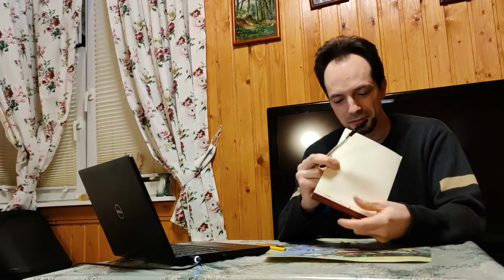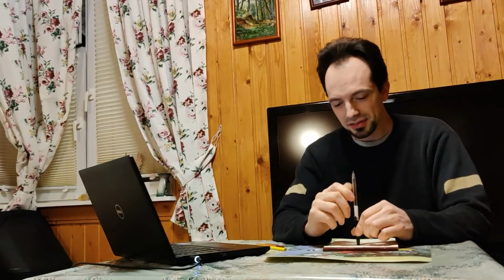Let's imagine that this blank notepad is a sample which we want to examine and get an image of, supposedly a magnified image, because we want to achieve some kind of magnification. So this pen is an electron beam coming from the top. The third thing that we need is some kind of detector, because we want to detect outgoing signals from the sample, which in this case would be secondary electrons.